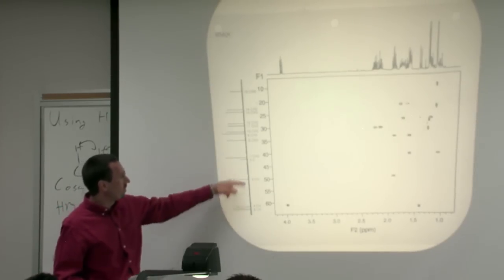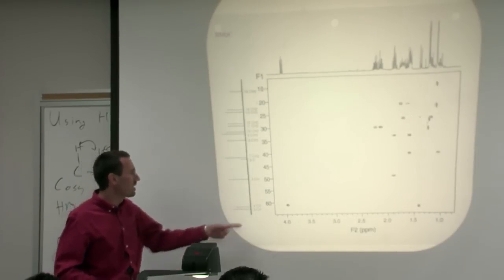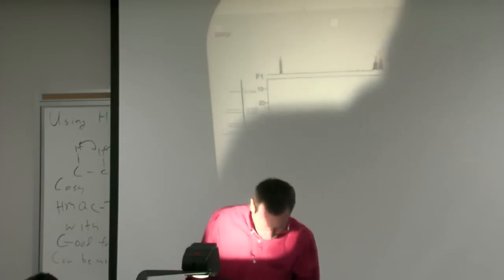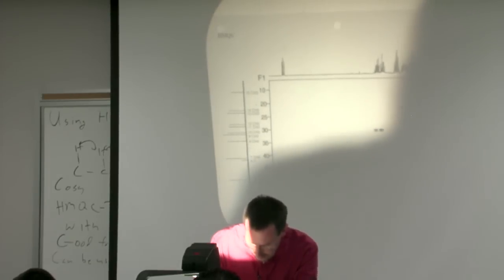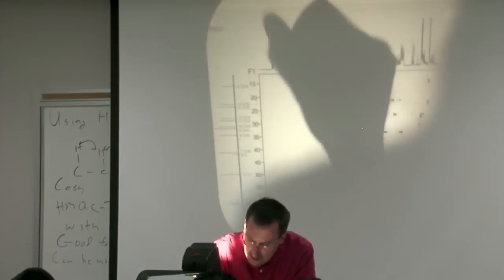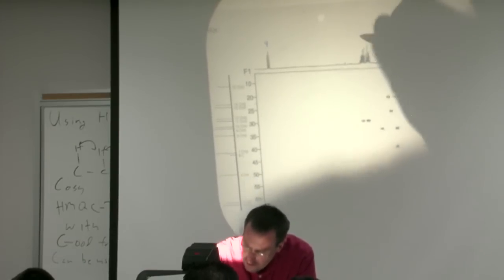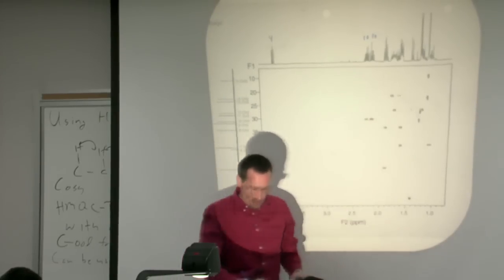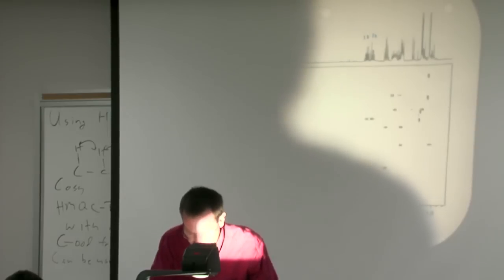So I've already labeled your axes with your hydrogen count, your methines and methyls and methylenes from, say, a DEPT spectrum. And we've gotten our carbons here. And so we have some numbers here. If we're correlating our carbons and our protons, I'm just going to transcribe our numbers here. So we have our methine, which is number 4 here. This guy here looks like it's number 10 and 10. By the time we get over to this next multiplet here, it's less clear. We're getting a cross peak from 8 and a cross peak from 5.